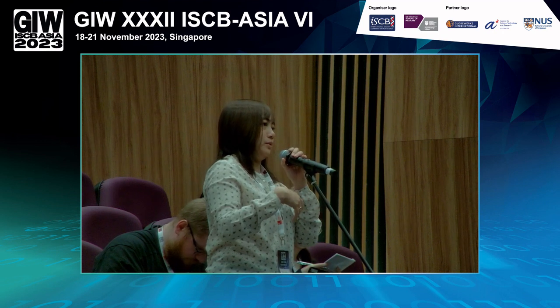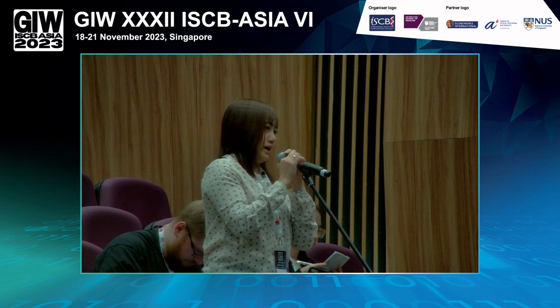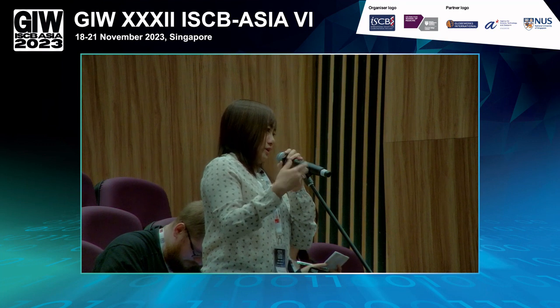Our team also uses Nanopore a lot, and we use both Nanopore and short read sequencing, and most people would know by now that ONT has quite a high error rate. How do you feel about using that? How reliable is it?